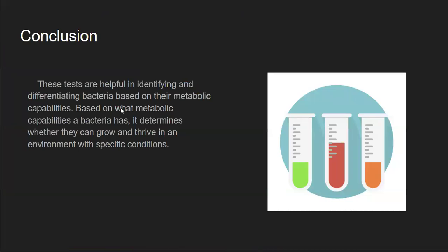In conclusion, these tests are helpful in identifying and differentiating bacteria based on their metabolic capabilities. Based on what metabolic capabilities a bacteria has, it determines whether they can grow and thrive in an environment with specific conditions. Thank you.